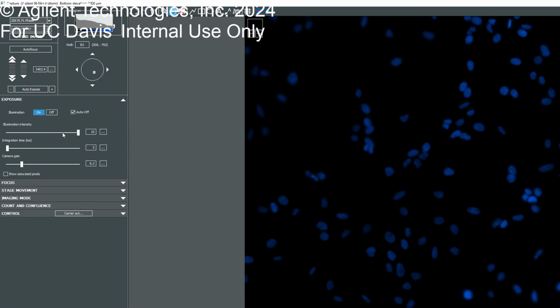Yeah, so that's a good question. When you actually auto expose, it's just trying to briefly determine what's the exact timing for that, and based off this, if I now capture this image, this image will be captured at a 5 millisecond interval. So this image will be exposed for 5. Whatever you capture is just going to be here, and this is just live. So this is like constant illumination of your sample.